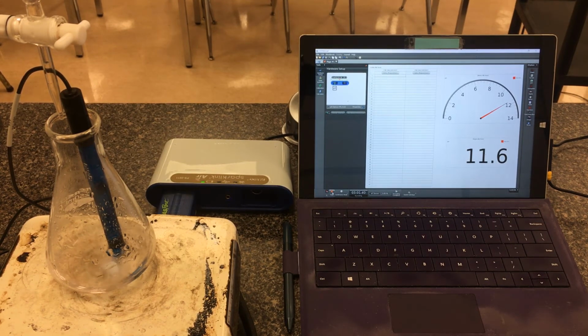That's the part I would want to do in a little more detail, try to figure out when that steep jump really occurs so I can find the equivalence point. Thanks, guys.